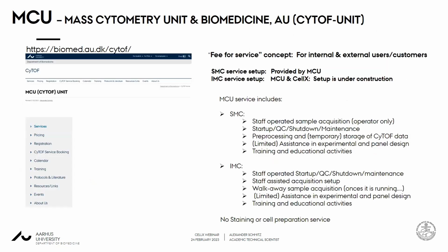And the service that we provide, and this is a kind of fee for service concept. So we have some prices for certain services, and then you can get your data acquired. And we do that for the suspension part, but also for the IMC part. However, we do not do staining or cell preparation. And with we, I mean basically me. So I probably have enough to do with the LC. And this is actually what I wanted to say.